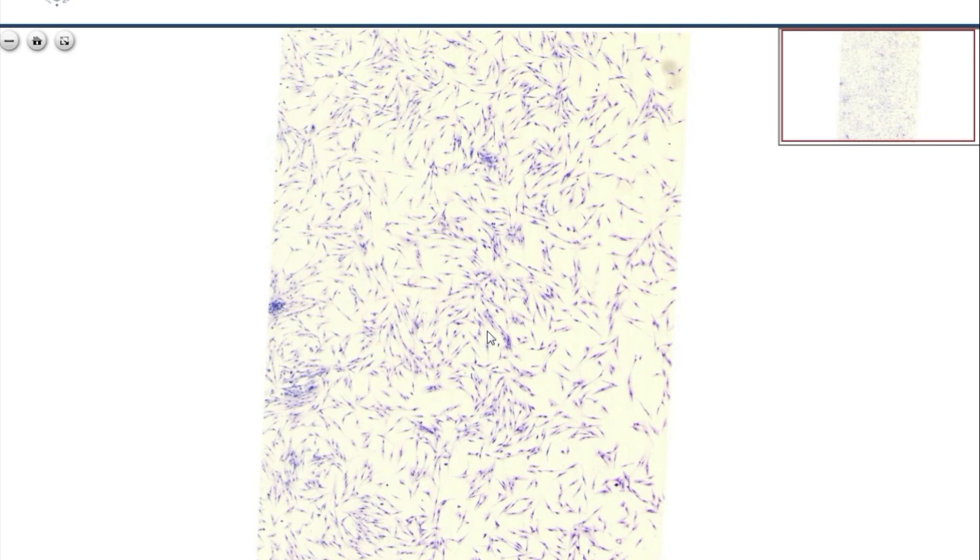The slide shows cultured fibroblasts and fibrocytes. They are stained with the so-called gentian violet, which is a metachromatic dye. The preparation was prepared so that the cells were cultured on cover glasses and mounted onto a thicker glass slide with the mounting material.